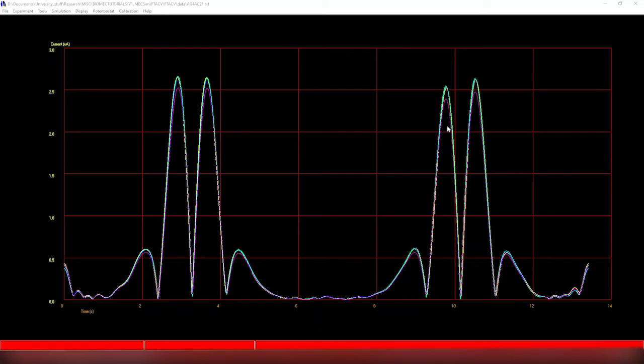Okay, so I've just loaded up 5 triplicate experiments, and this is what I would call probably on the higher end of what you're going to get for triplicate experiments. We look at the peak currents at these values here and this value here, and generally, as long as they're reasonably similar, it's good data. The harmonics information here for the forward process and here for the backward process also looks very symmetrical, which is also very good, and very defined.